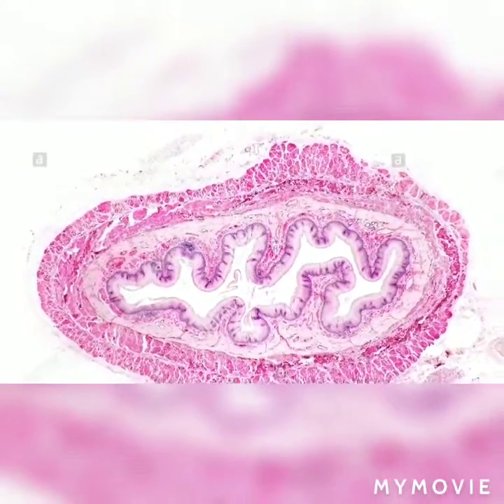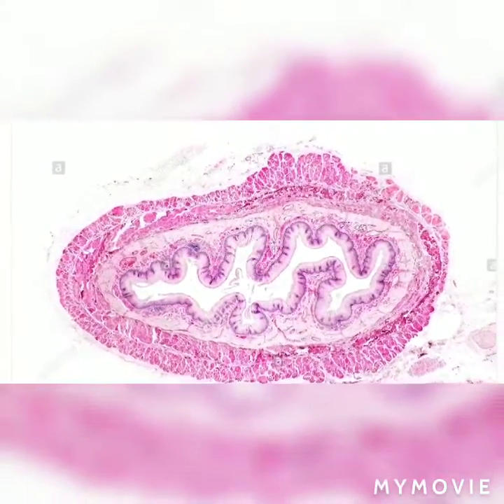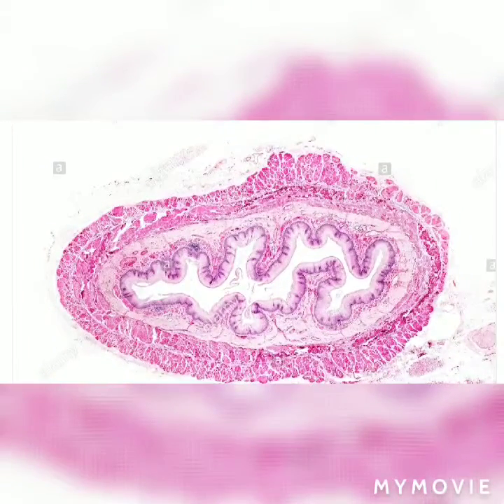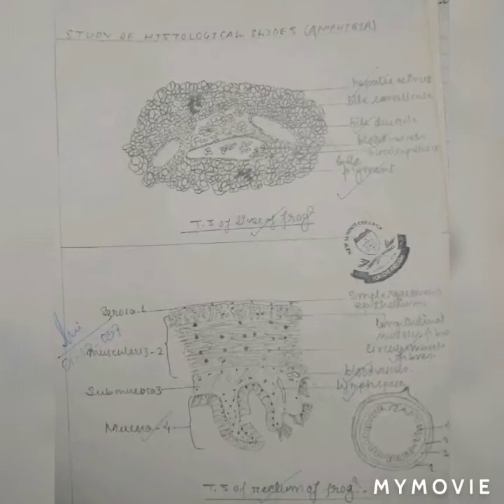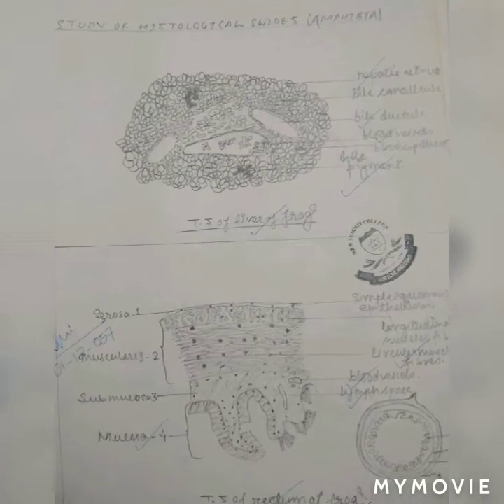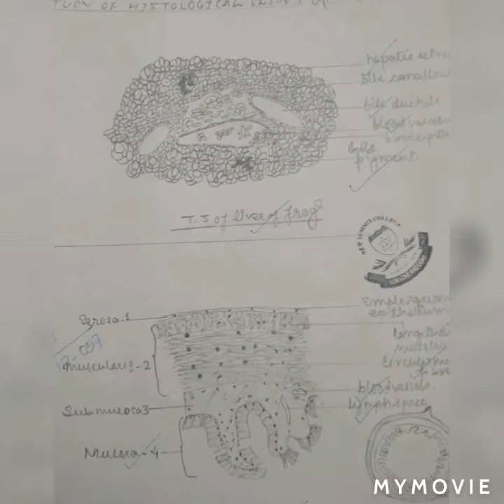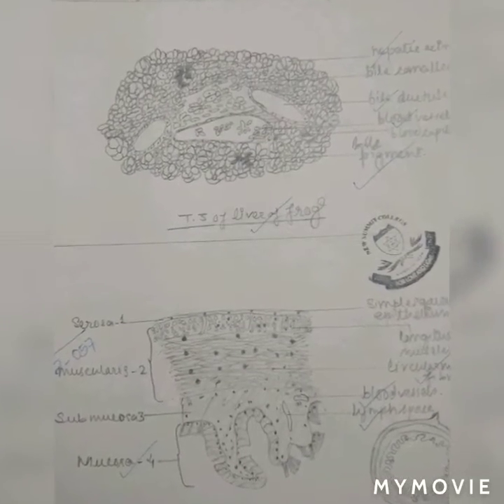Comments on TS of esophagus of frog: it is composed of the usual four layers, that is serosa, muscularis, submucosa, and mucosa. The serosa is thin and made up of a single layer of peritoneal cells. The muscularis has muscle fibers arranged in two layers: an outer longitudinal and an inner circular layer.